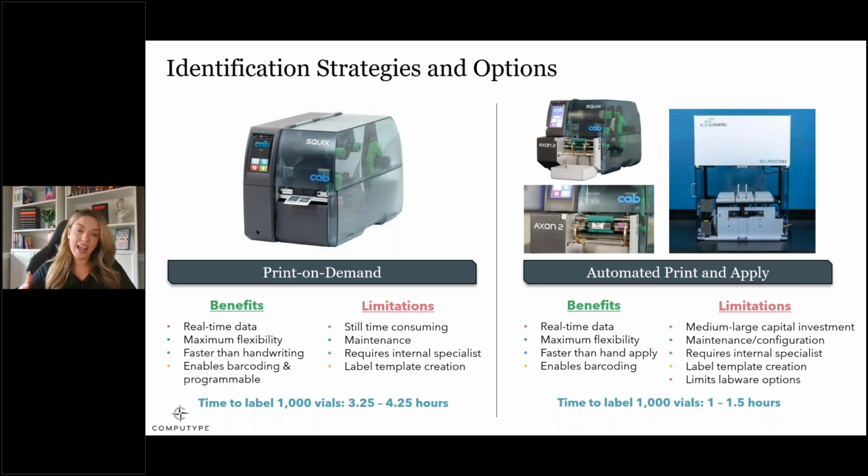But in addition, as the complexity of your equipment grows, you also have additional maintenance and configuration. You'll still have to manage these label templates. And it does require a little bit more in-depth internal specialist, a little more training.